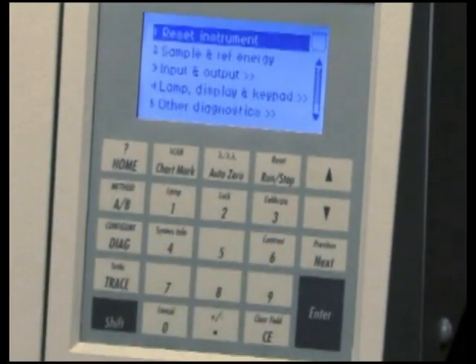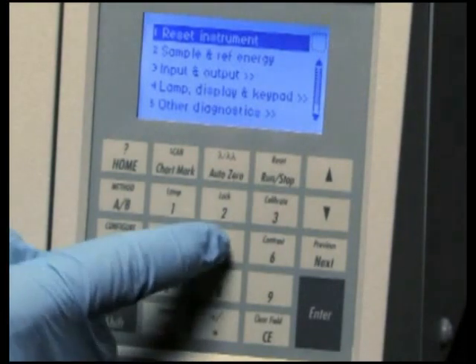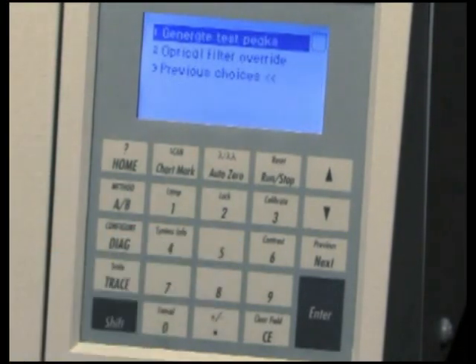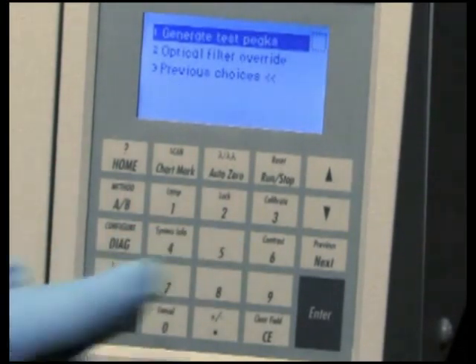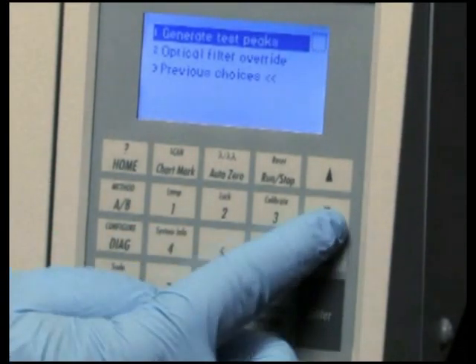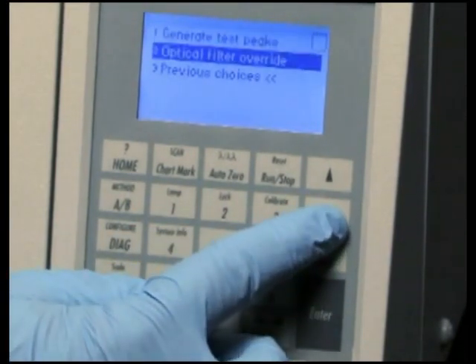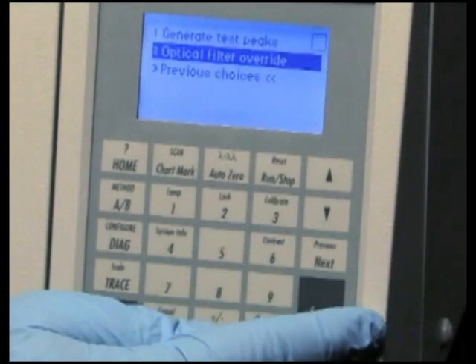Selecting Other Diagnostics allows you to generate test peaks or to override the default filter user setting.